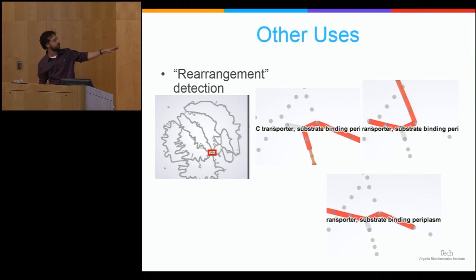In this case, this is, I think, about 60 Brucella suis genomes, and this nexus point highlighted in the middle is the nexus point between chromosome 1 and chromosome 2. What we found by creating this graph and looking at all the genomes is that almost all the genomes do follow the top two paths that you see here.